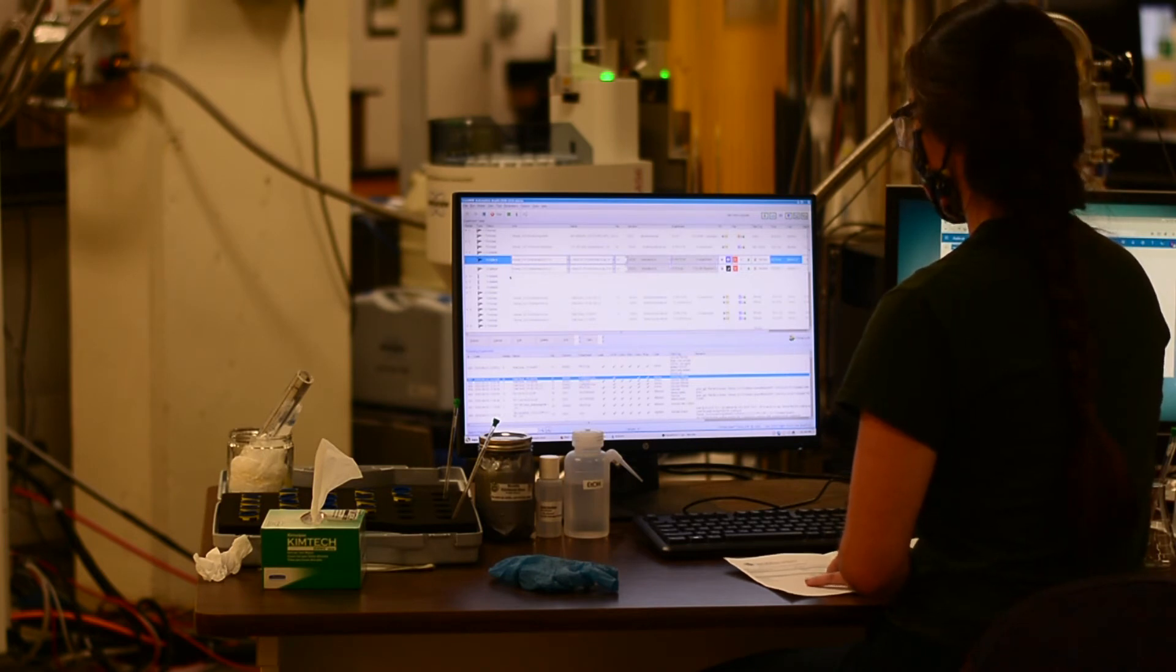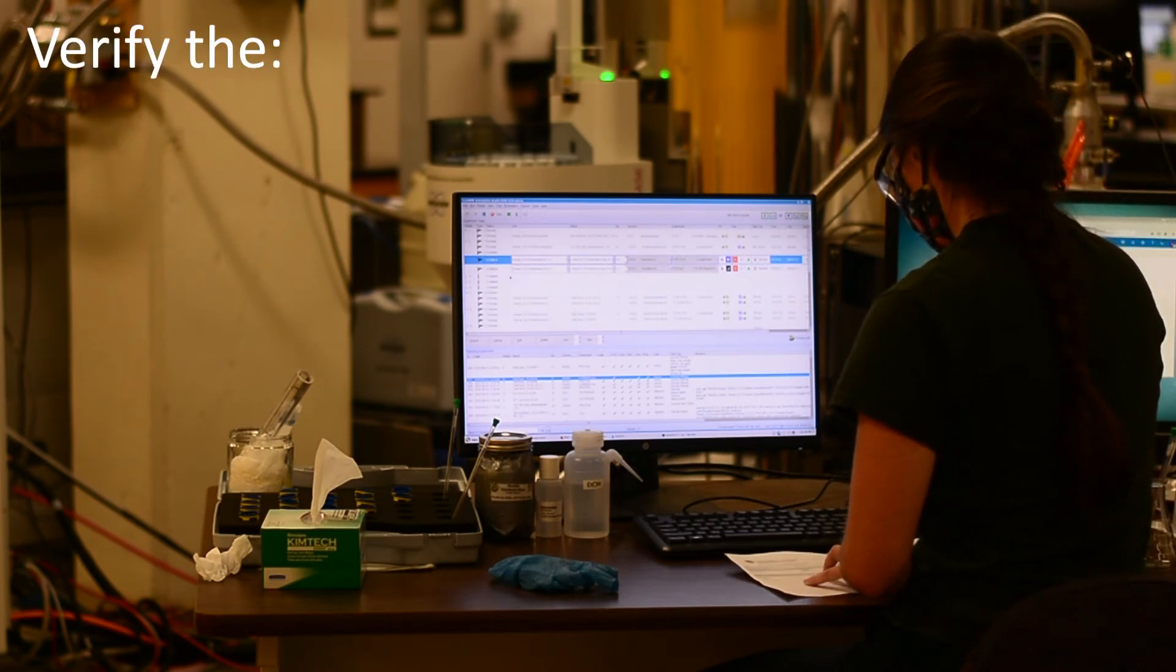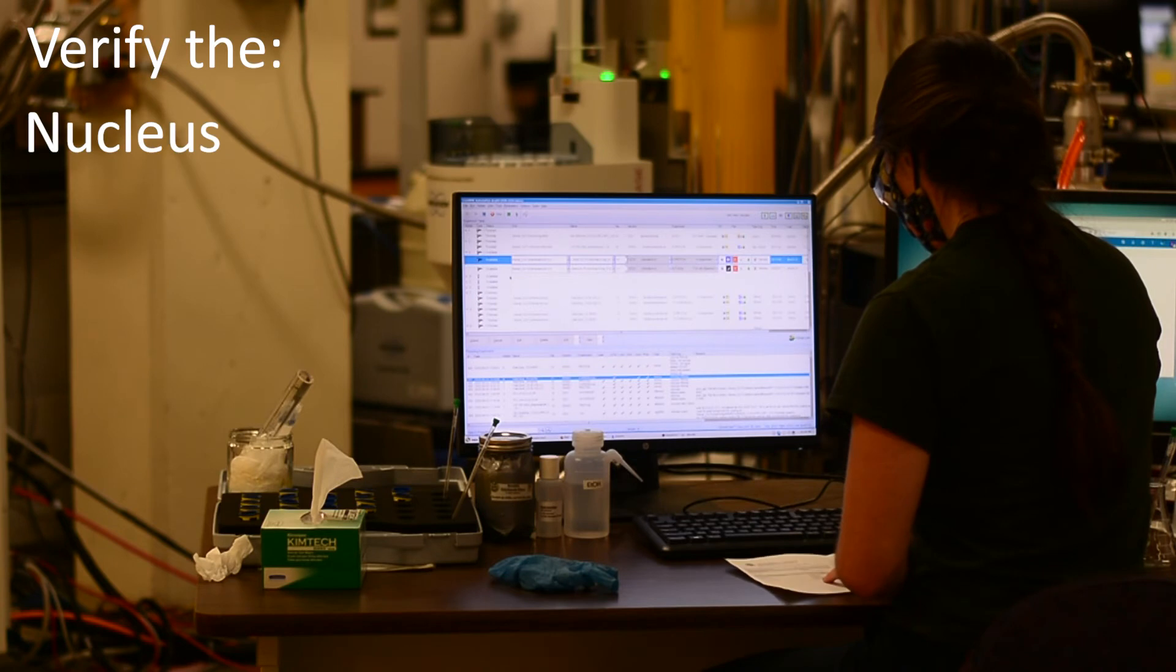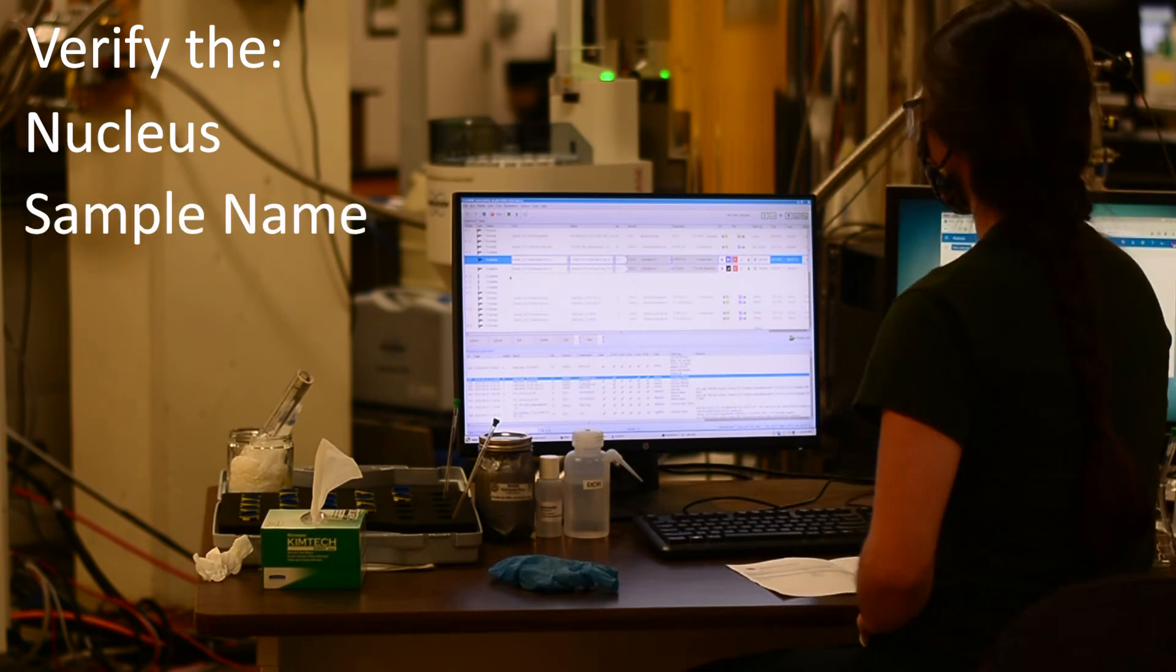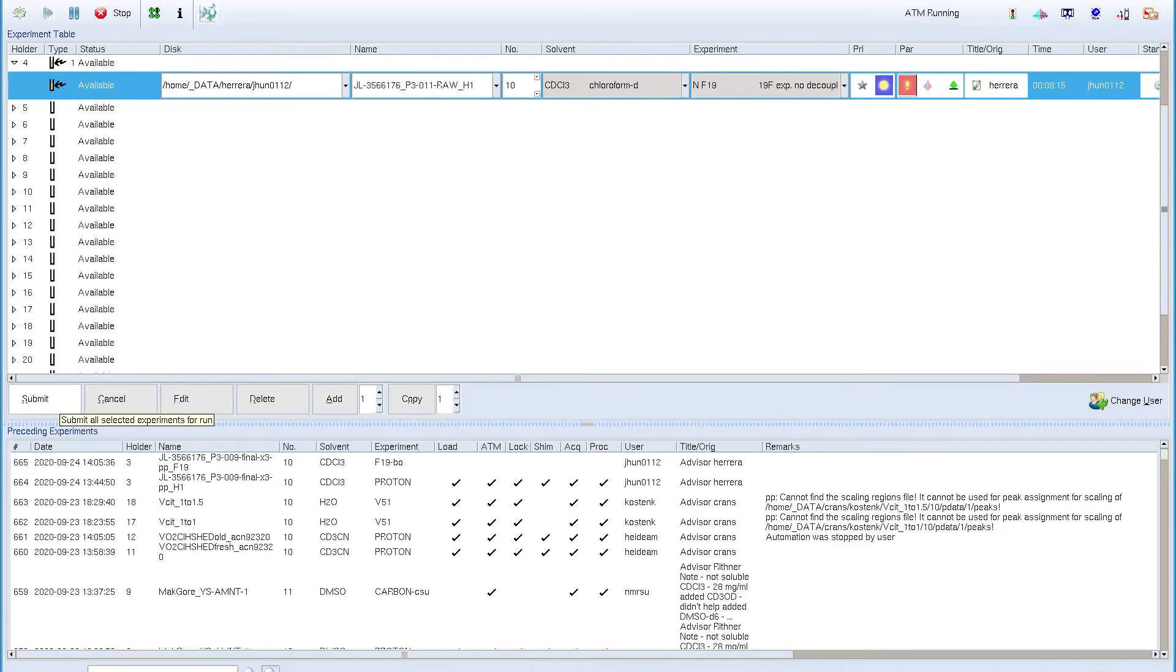Once you have all of your parameters selected for your sample, including the nucleus, your sample name, and the experiment you want, then you'll go to the submit button and click submit.